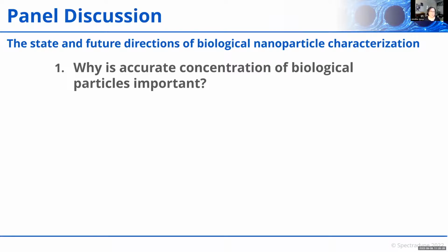But a lot of people are also interested in these biological nanoparticles in biofluids for the information that they can convey to us relating to health or disease. And since these are diagnostics, it's really important that when we have a number, there is accuracy to that number, meaning that it reflects the truth of what's really there. And with these nanoparticles, the challenge to seeing the truth of what's there is the detection limits of the instrument.